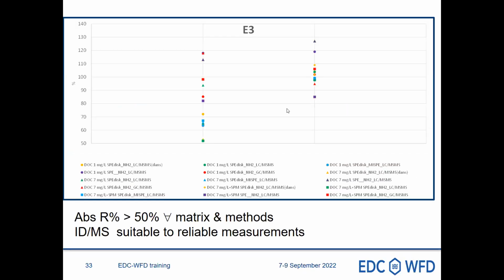Now let's go to recovery. So in the project, we have evaluated both absolute and relative recoveries because we feel that both are highly important to be under control and also to achieve the best LOQ, and also the more accurate method, and to have also the uncertainty under control.